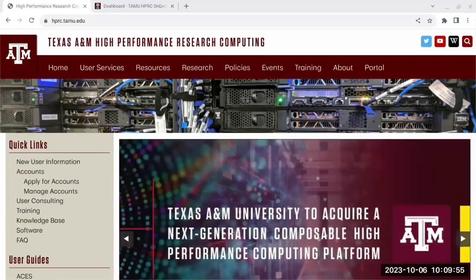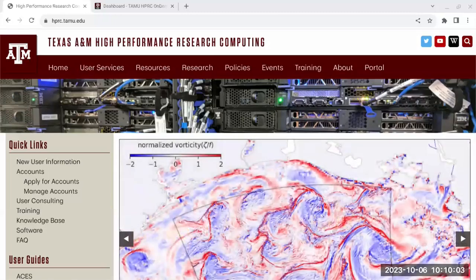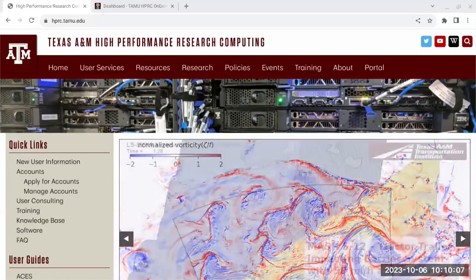It's really kind of like the portal, because in the portal, you have a command line, but you also have a file system browser. So you can view the file system and you can view images from the portal, similarly to how you use MobaXterm.